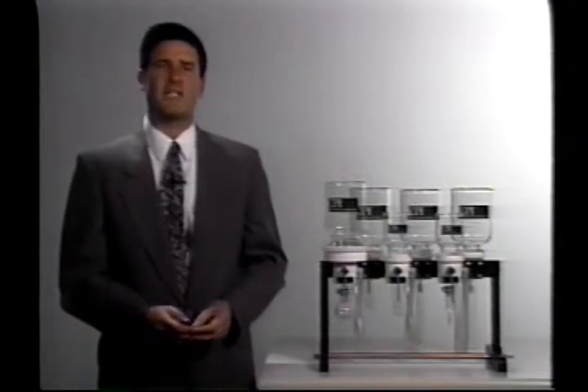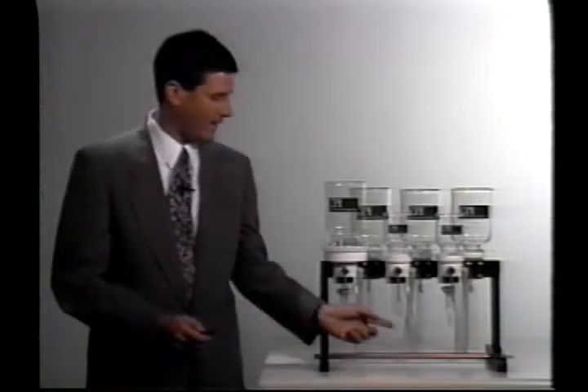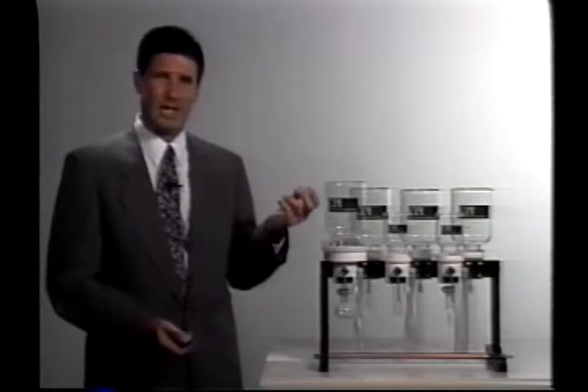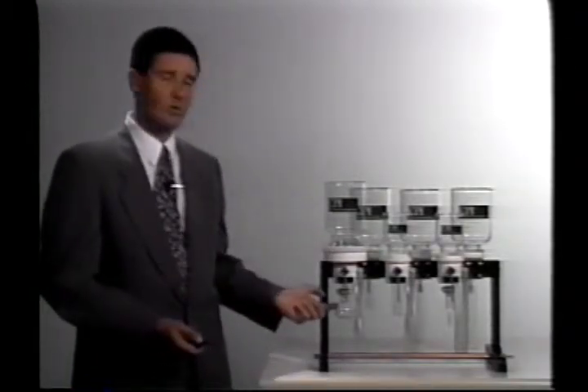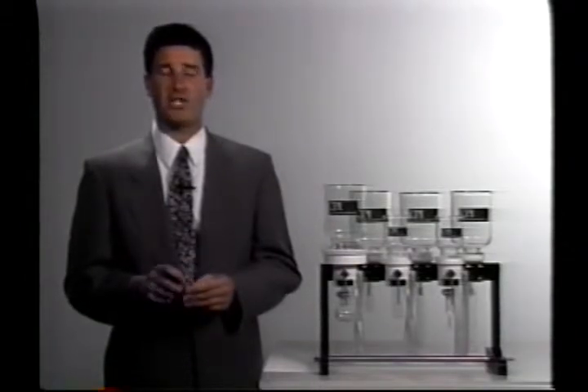Each extraction station is capable of receiving a standard threaded VOA vial. This gives you the flexibility of using any size of standard VOA vial as a collection vessel, or you can screw in a glass joint and use any sort of boiling flask or concentrator tube which might be appropriate for your method. The reason that CPI has designed this manifold to offer so many different options is simply so that you can get one manifold that will not only perform all solid phase extraction techniques you may currently be performing in the lab, but one that will also be versatile enough to adapt to any solid phase extraction techniques which may be called on in the future.